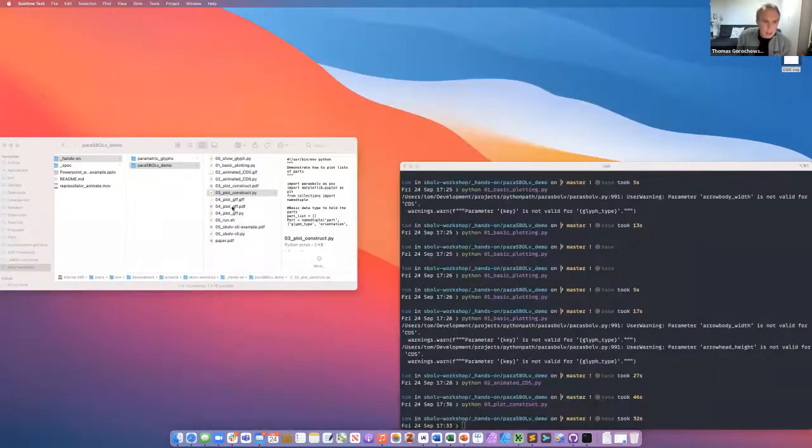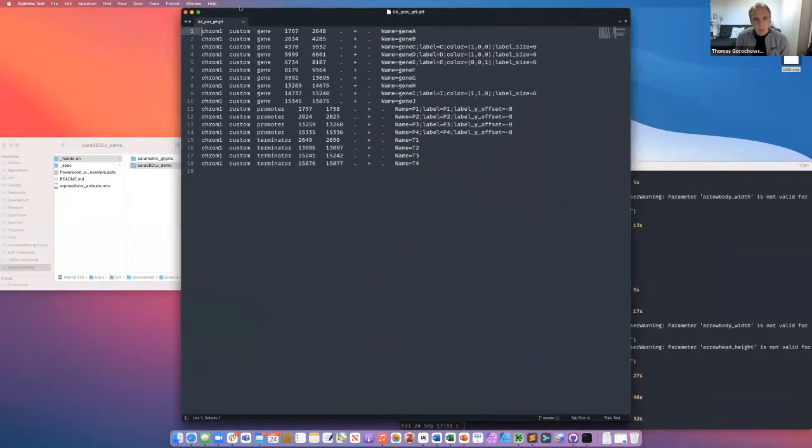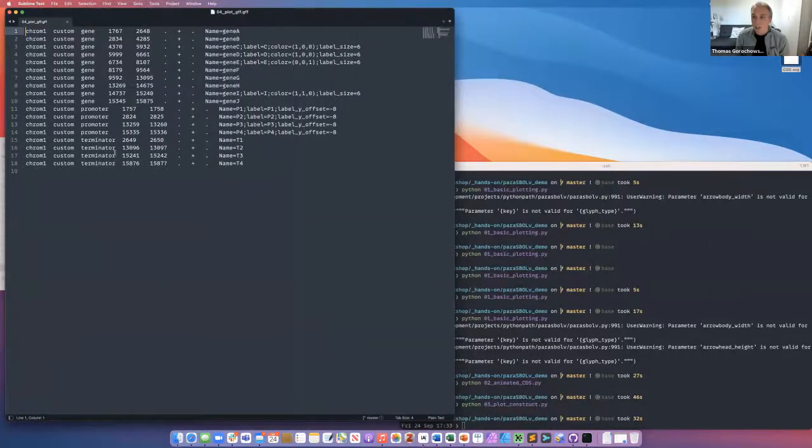So that's that. Obviously, once you can do something like that, it's really trivial to then extend it to take in as input some of these standard formats that people use for describing annotated sequences. An example is what's known as a GFF format. This is a text-based format which is often used for annotations of genomes.